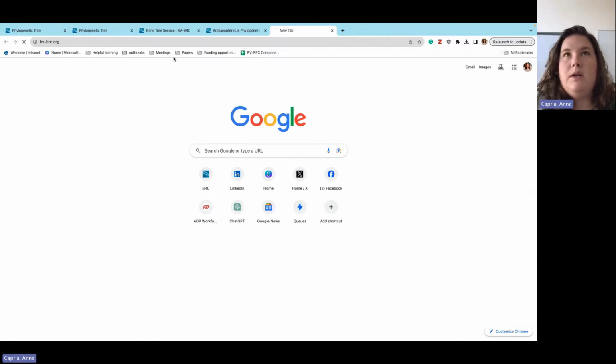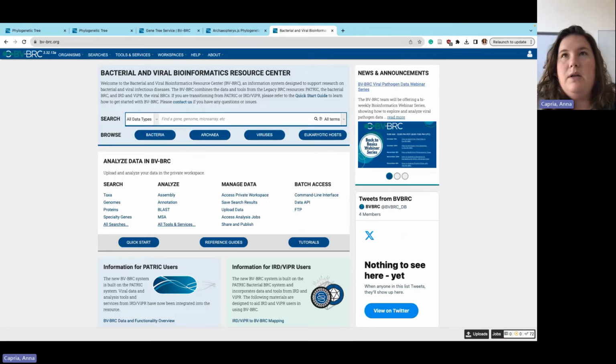The BV-BRC can be found at bv-brc.org, and this is our homepage. I'd mentioned earlier that if you were interested in attending one of our future webinars, feel free to click on that in our news and announcements section. And if you don't already have a workspace, you should have a little option at the top that will allow you to create a workspace.